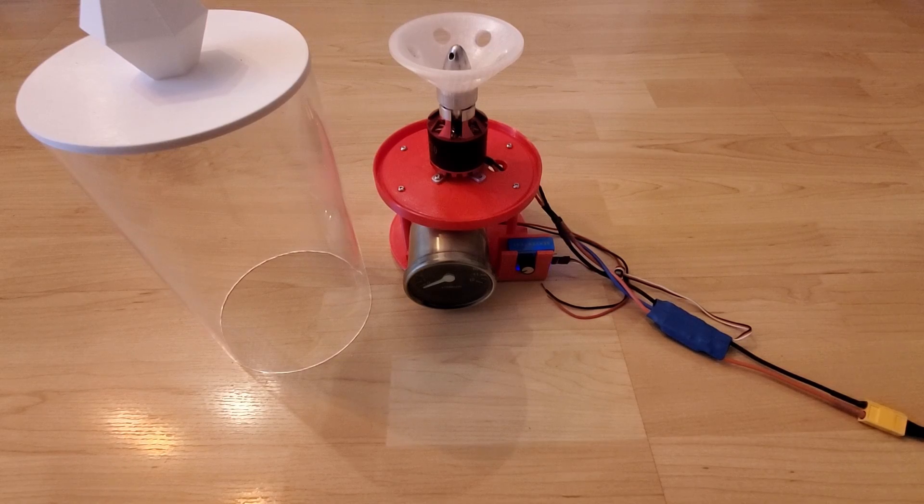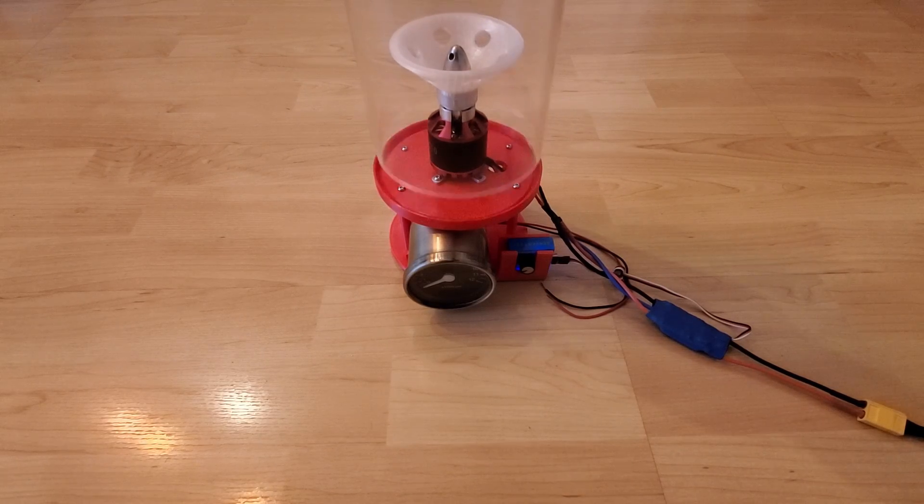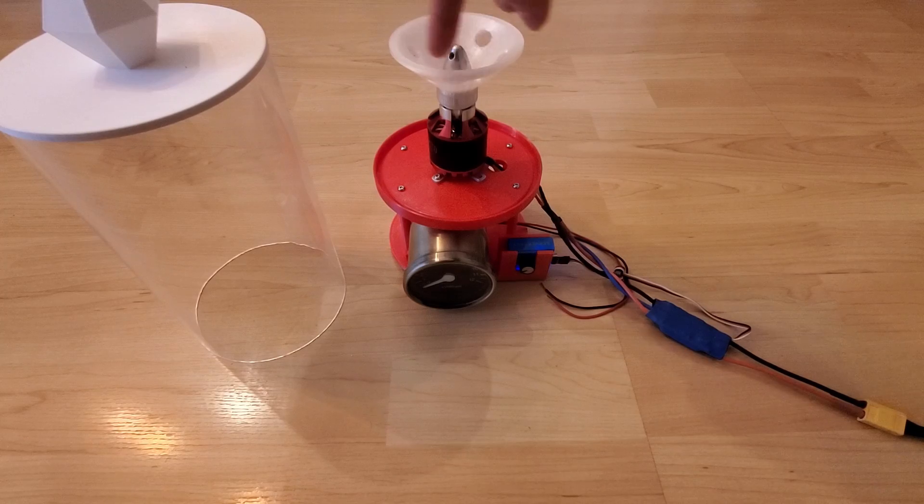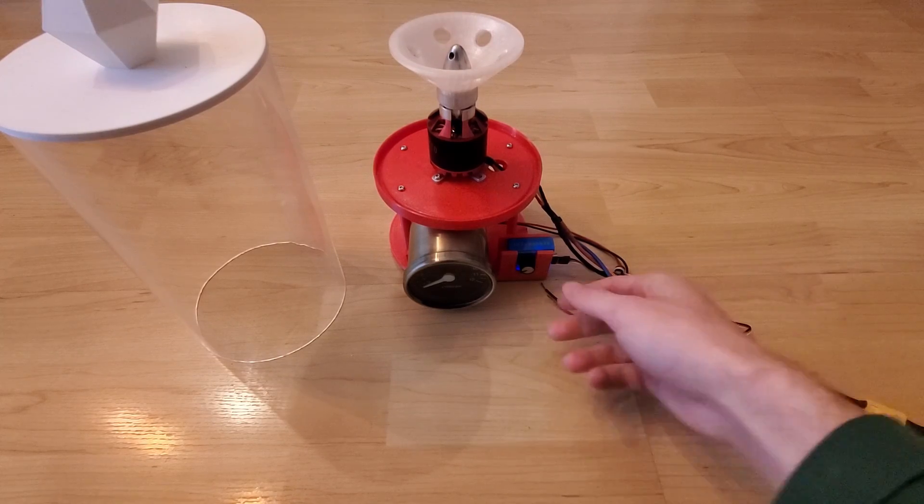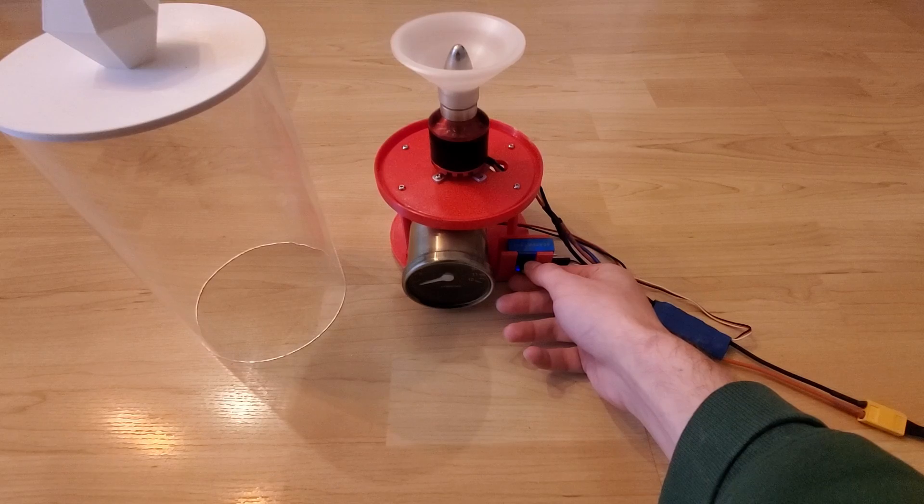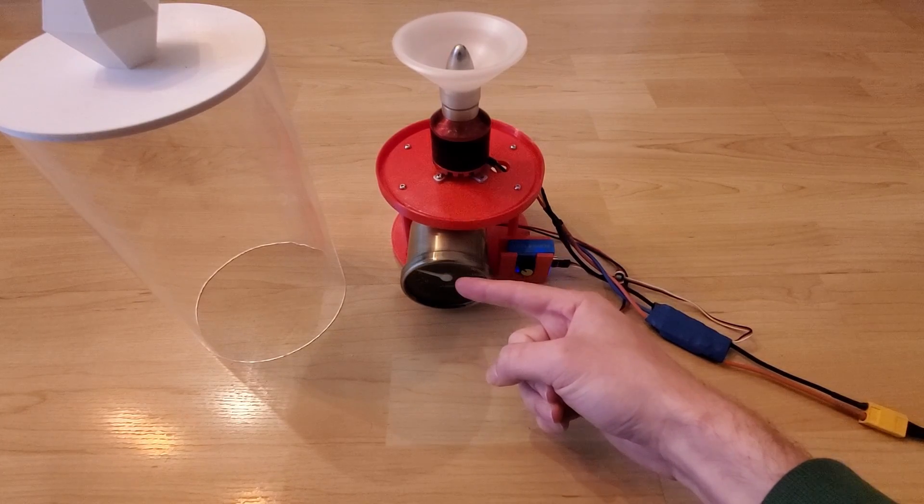Other than that the centrifuge works basically the same. You have the cloche on top, add extra protection while it's spinning. You can load in the samples in top and then to control the speed we just twist the dial here, the speedometer goes up.